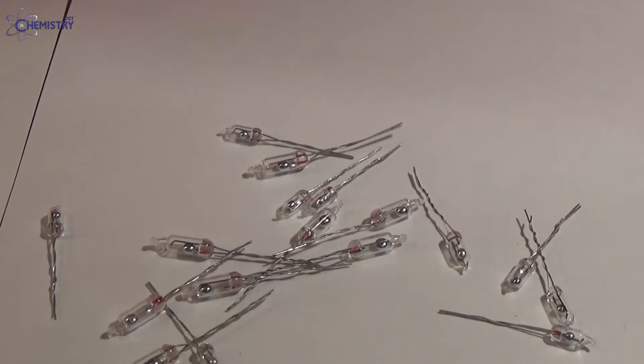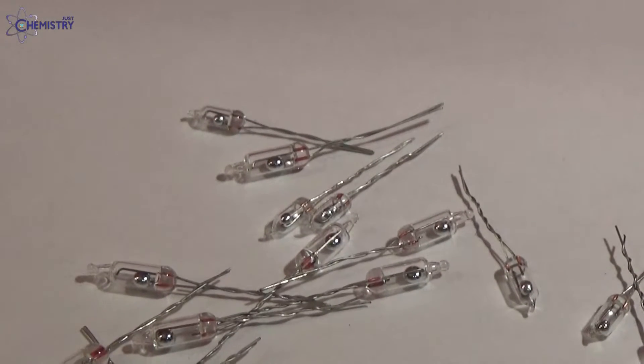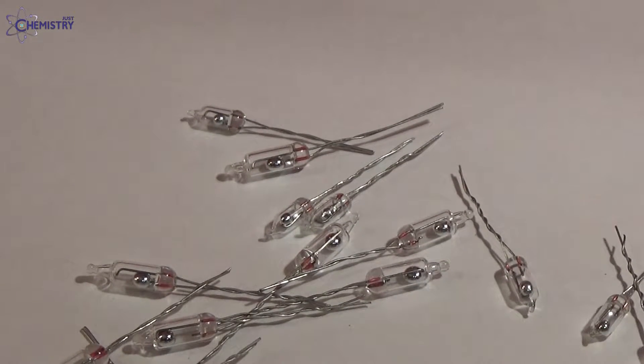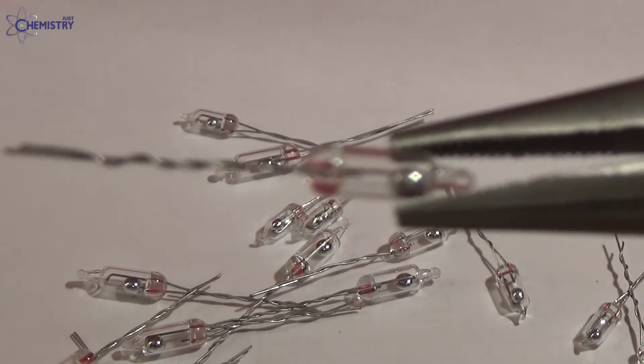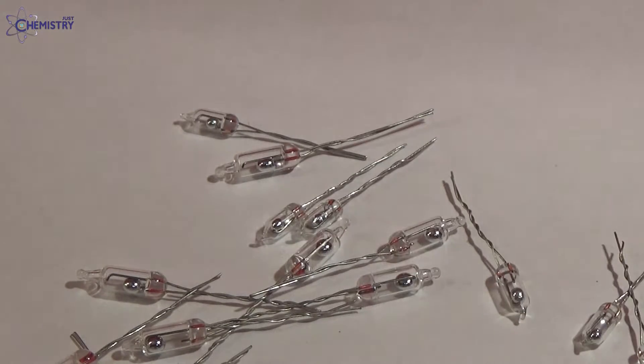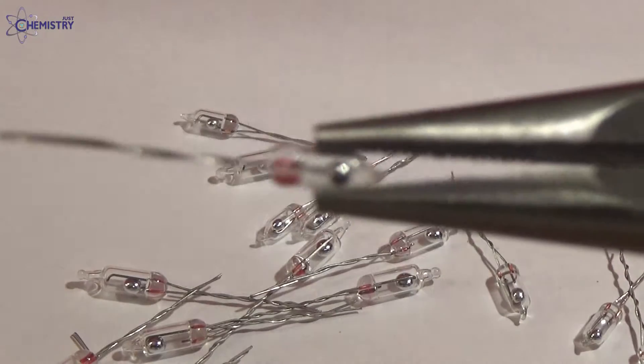So, I bought a few pieces and I have 5mm size, which is the bigger one, like that. And I have a little one, 3mm size.